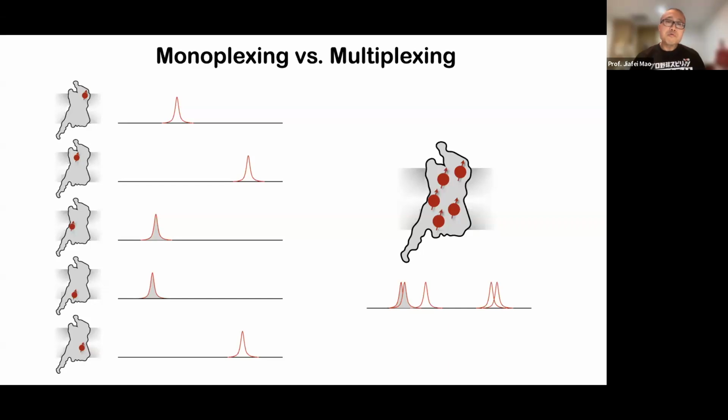Because if you don't have excellent resolution, then sometimes it's not possible to do the conventional multiplexing spectroscopy, which means you do uniform labeling on this protein and visualize all the sites through one sample. But sometimes you have to just dissect the system into multiple samples, with different labeling schemes, and do kind of monoplexing. So that's a tedious amount of work.